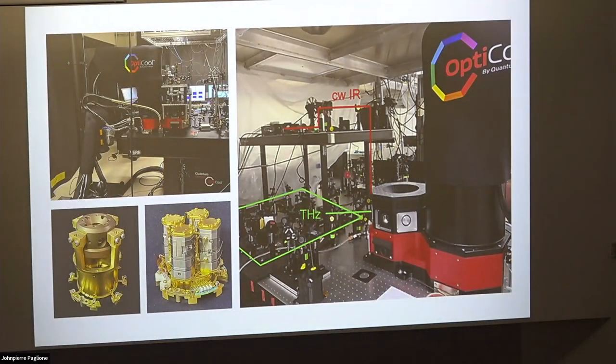What does OptiCool look like in the field? You can see why Quantum Design cannot, at this point, provide any plug-and-play measurement options, because these are complex experiments. Everybody wants something custom.